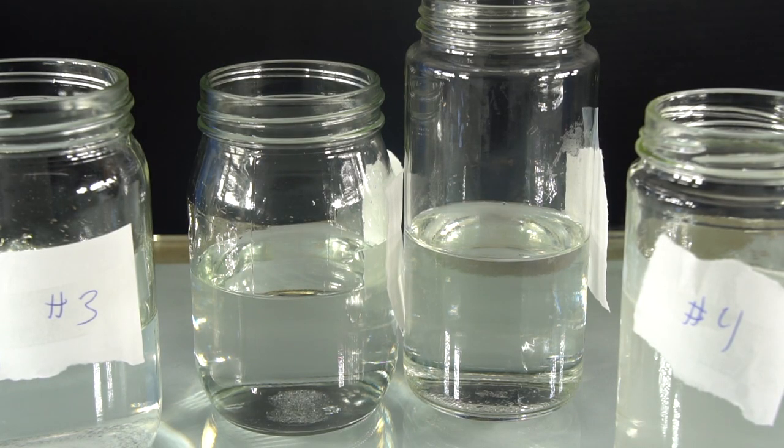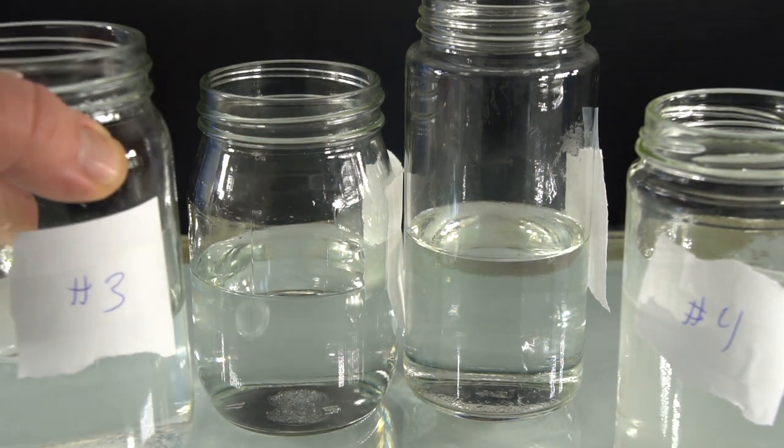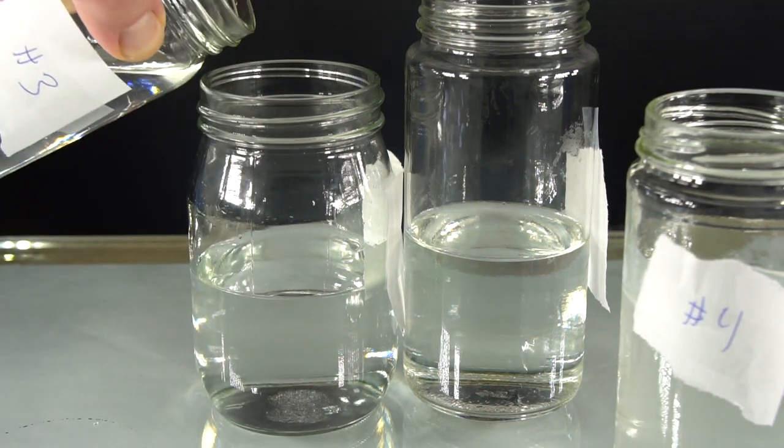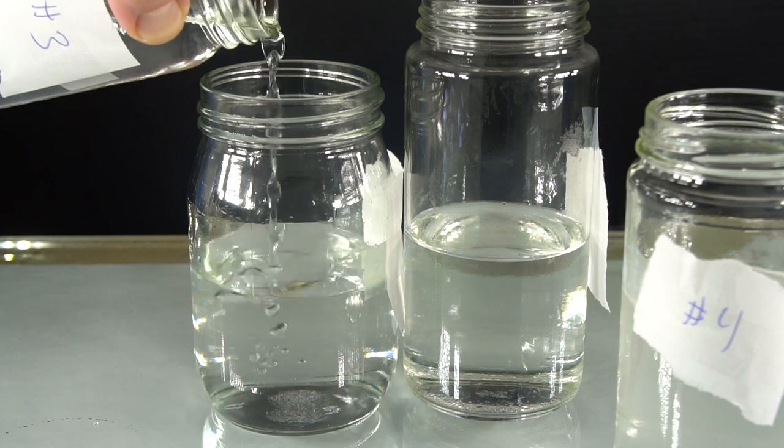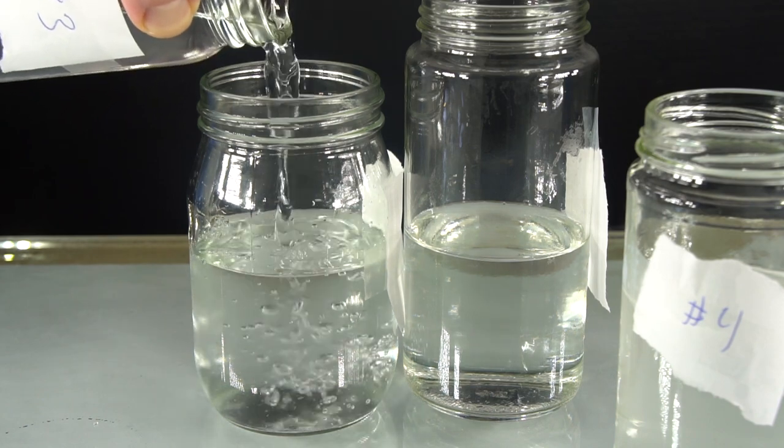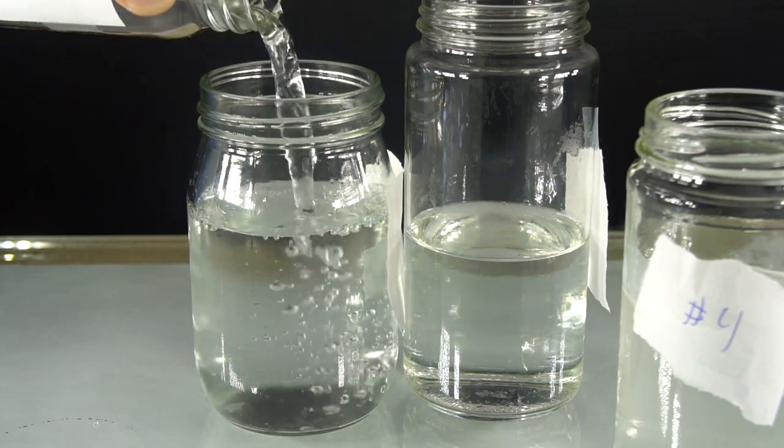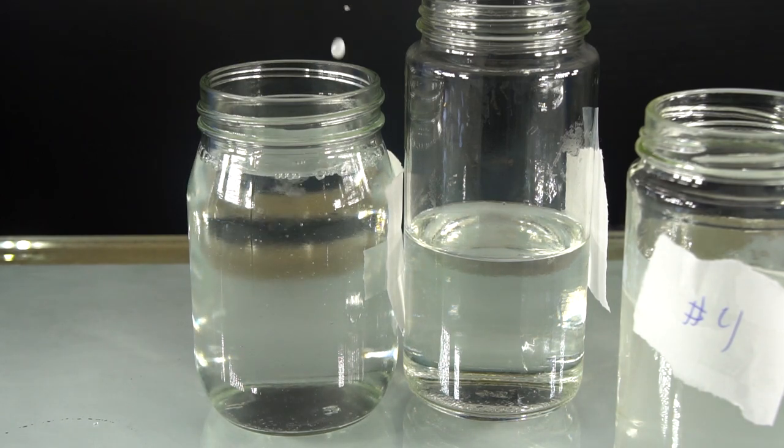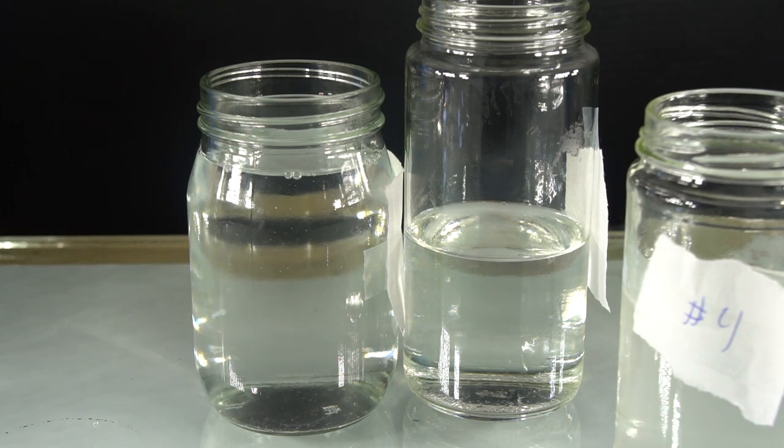Now you are ready for the main reactions. Pour the jars of sodium bicarbonate and sodium carbonate, jars three and four, into the jars of magnesium sulfate, jars one and two. Pour jar three into jar one, and pour jar four into jar two. Many new compounds are about to be formed here.